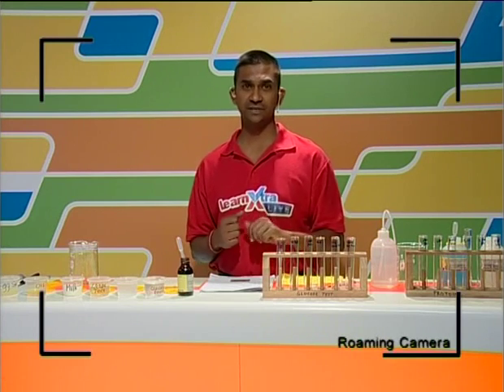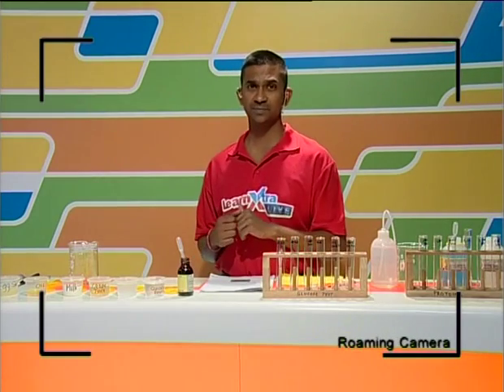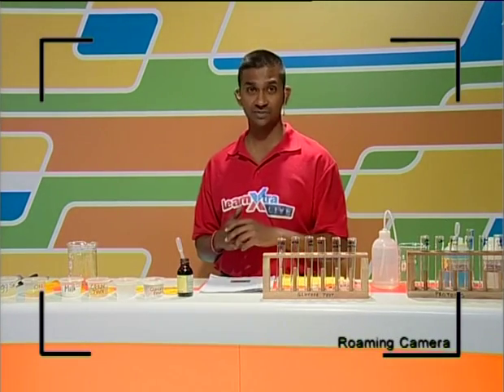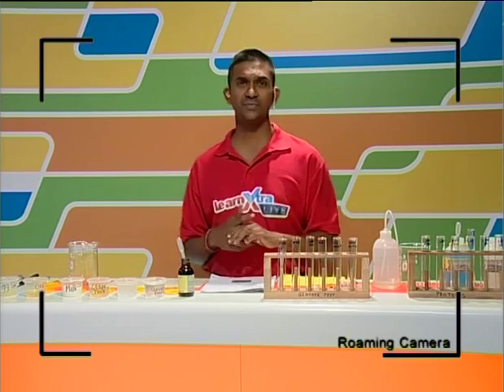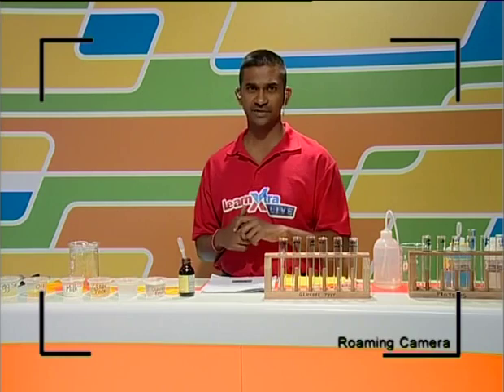Today we're going to be testing for proteins. We're going to be testing for the presence of lipids in different samples. We're also going to be doing a starch test to test the presence of starch, as well as the glucose test to test the presence of glucose.